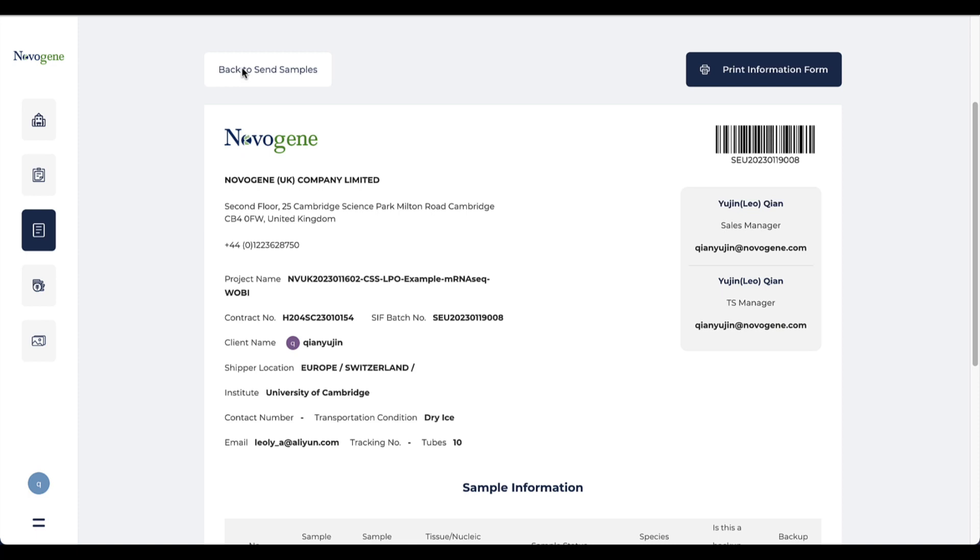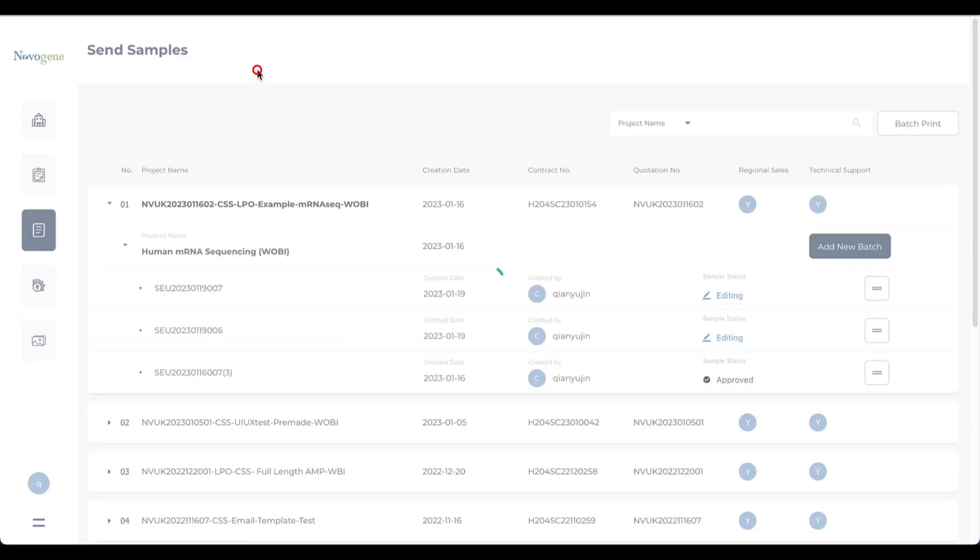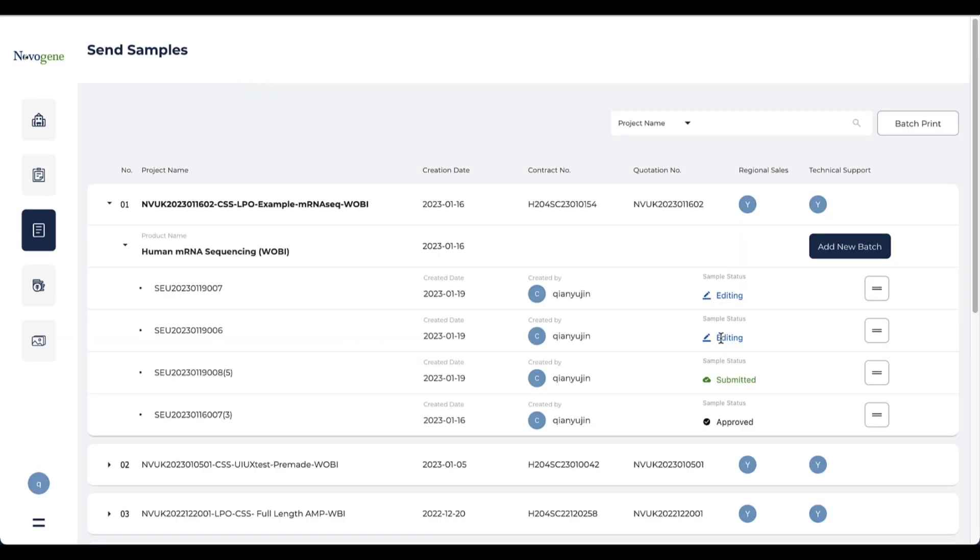After this step, you have finished all the steps about uploading sample information in the customer service system. If you go back to the sent sample page, you will find the batch number under the contract and marked as submitted.